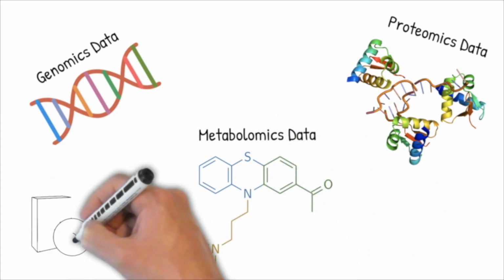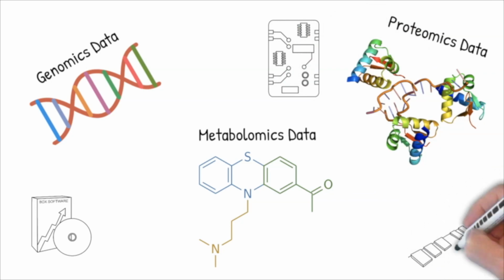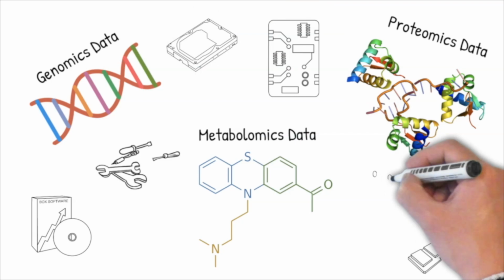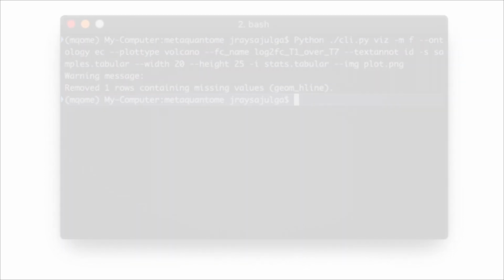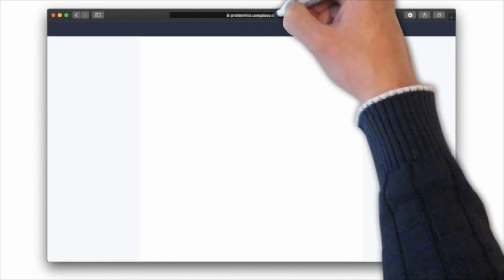For each of these omic data types, there are a bevy of bioinformatic tools available. By combining the results of one tool to another, we can get a more complete and nuanced profile of a biological system. However, putting this into practice can be overwhelming, since operating these software tools separately is time-consuming and ultimately not feasible. Fortunately, there exists a solution to address these issues by bringing all of these tools together in an accessible, user-friendly, web-based bioinformatics platform, aptly named Galaxy.